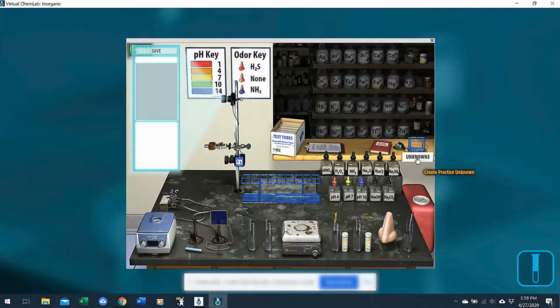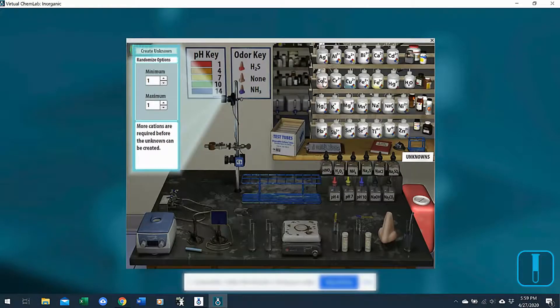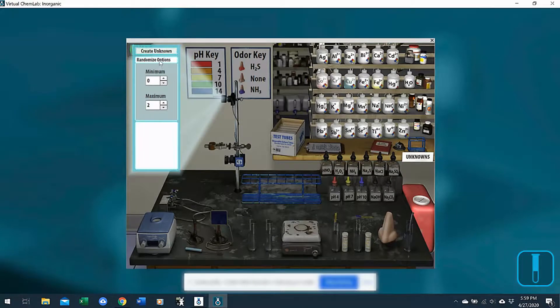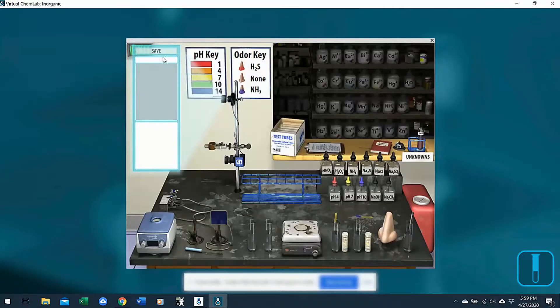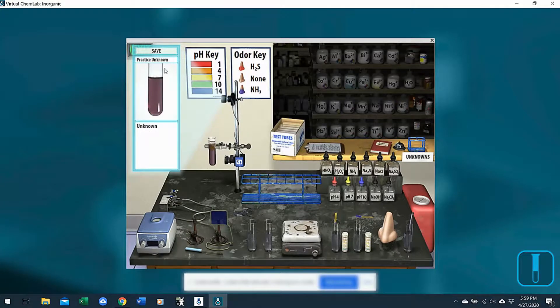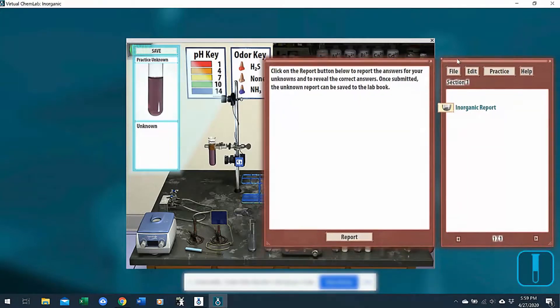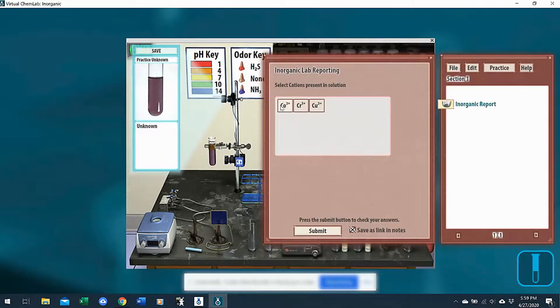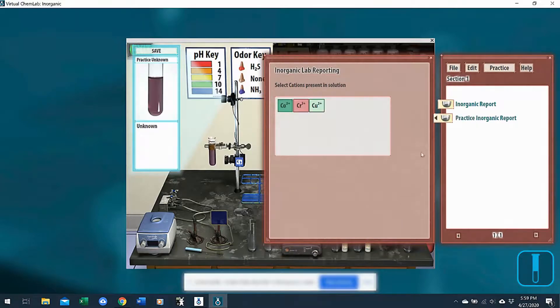The last way to create unknowns is with the unknowns card. When they click that, they can create an unknown with any number of cations in it. They can select minimum and maximum for how many cations could be in that tube, then click create unknown. A tube is created — called a practice unknown — with no number on it. They would report and determine what is in that tube using the lab book, clicking report, entering the cations they think are in it, clicking submit, and getting a report. You could also assess these as an instructor. We hope this helps you understand how they work — please let us know if you have any further questions.